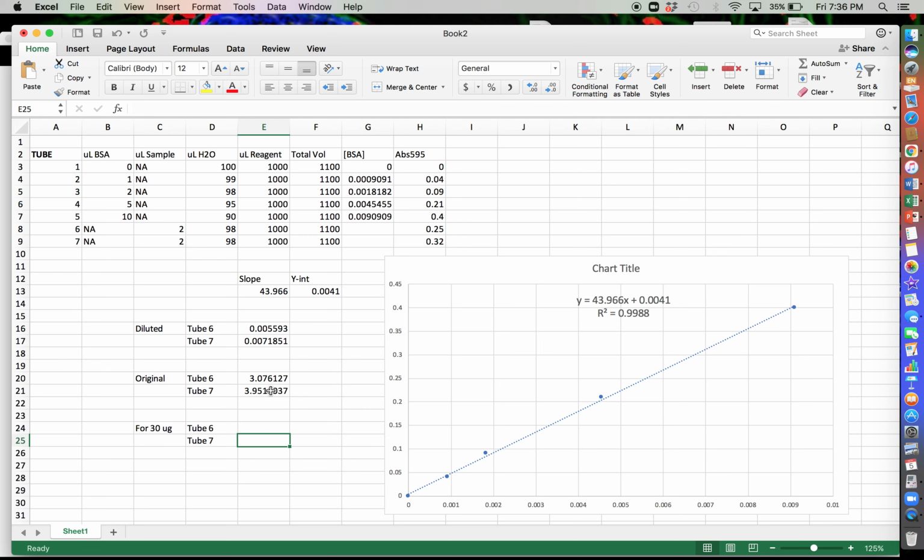People kind of like to add different concentrations of Laemmli, or it depends on what kind of stock concentration they add, but that is something that you have to consider. You're not just going to be adding the lysate directly to the sample because you need that Laemmli sample buffer for the SDS page because you need the SDS to denature and coat the proteins and all that good stuff that you're probably already aware of.